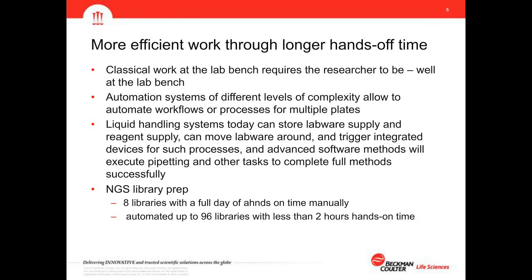Also, laboratory automation offers more efficiency through longer hands-off time. The classical work at the lab bench does require the researcher to be at the lab to perform this research and this pipetting. Automation systems of different levels of complexity actually allow you to automate full workflows instead of only the liquid handling itself or processing of multiple plates.